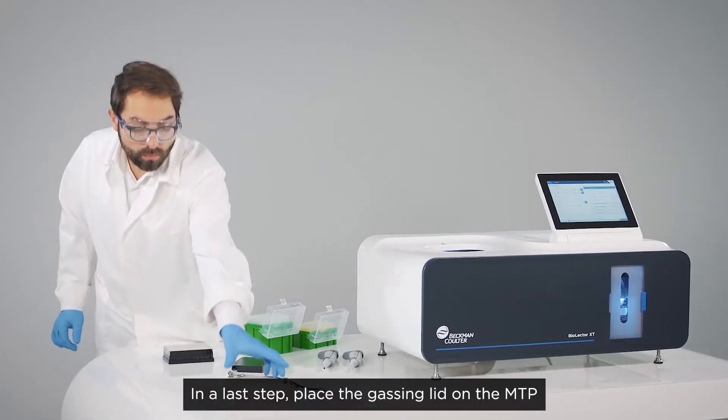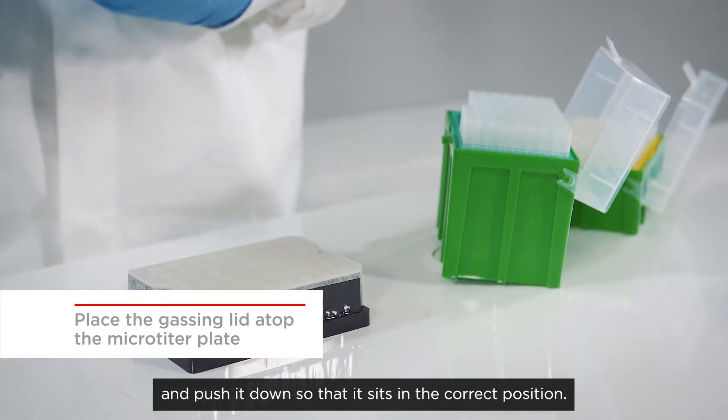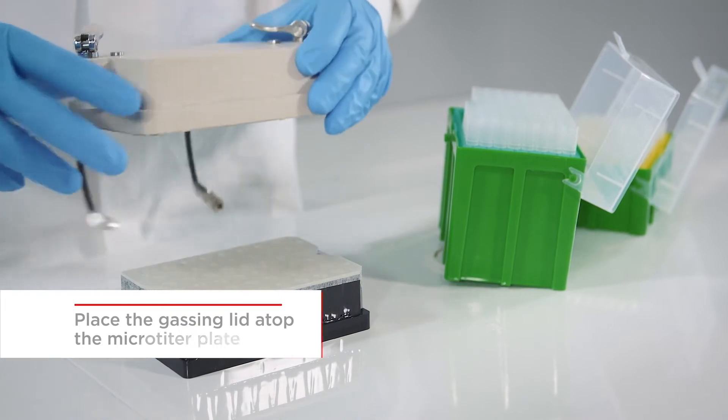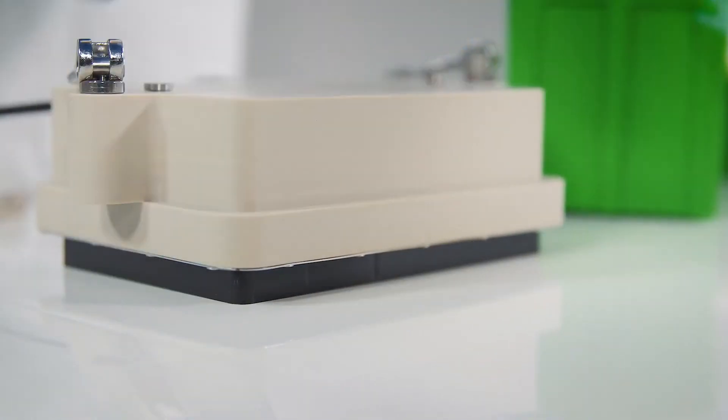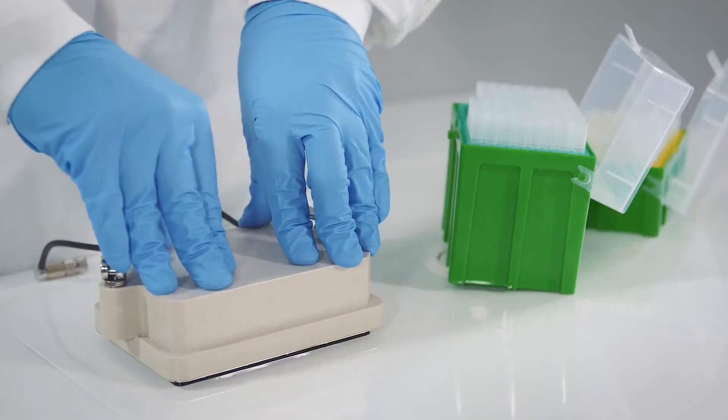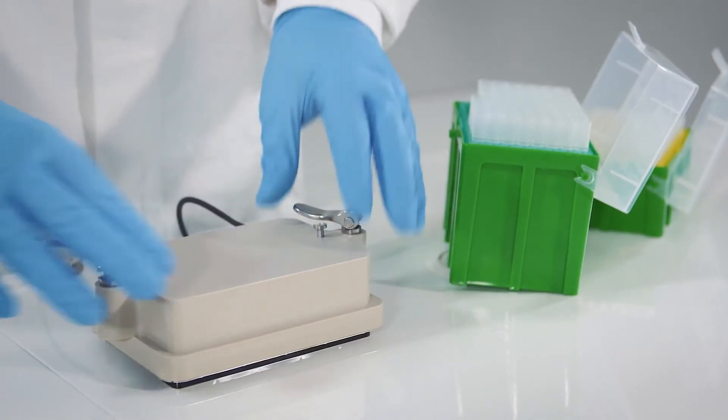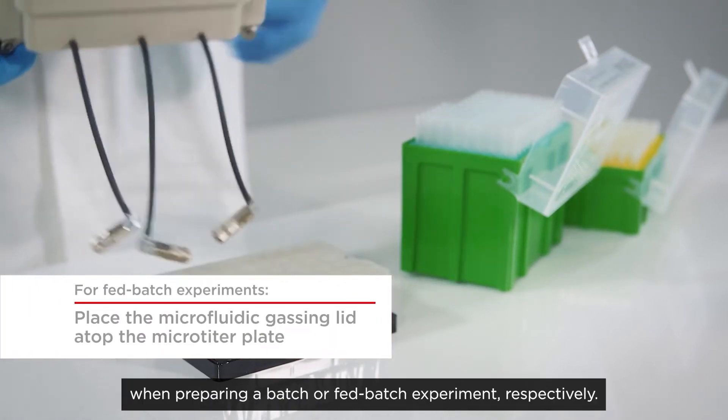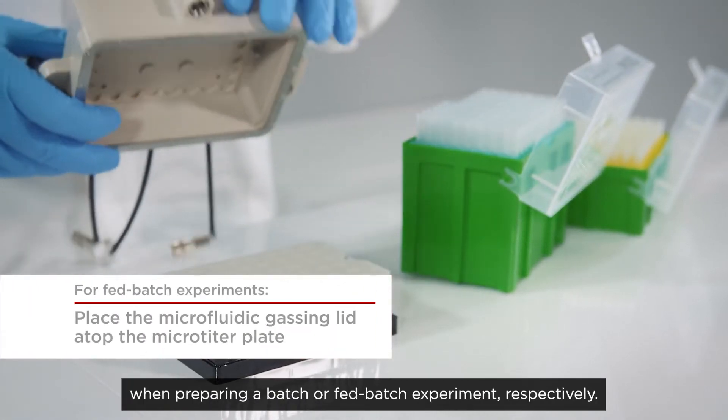In a last step, place the gassing lid on the MTP and push it down so that it sits in the correct position. Make sure to use the correct gassing lid when preparing a batch or fed-batch experiment, respectively.